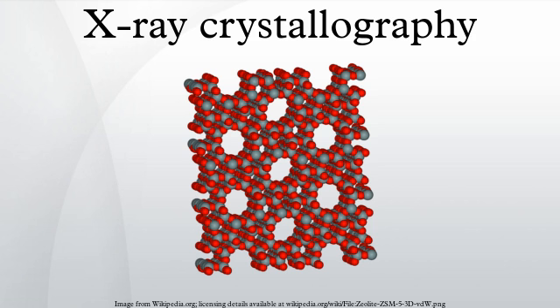density F(r). Crystals are often idealized as being perfectly periodic. In that ideal case, the atoms are positioned on a perfect lattice, the electron density is perfectly periodic, and the Fourier transform F(q) is 0 except when q belongs to the reciprocal lattice. In reality, however, crystals are not perfectly periodic. Atoms vibrate about their mean position, and there may be disorder of various types, such as mosaicity, dislocations, various point defects, and heterogeneity in the conformation of crystallized molecules. Therefore, the Bragg peaks have a finite width and there may be significant diffuse scattering, a continuum of scattered X-rays that fall between the Bragg peaks.